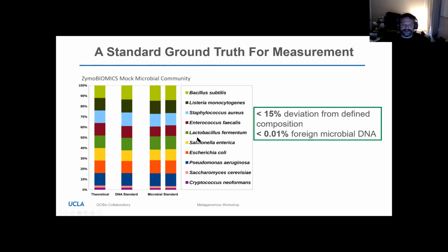So if you want to take the data that I gave you and see how it looks compared to this, it's actually fairly easy to do. You just have to do composition tables and that kind of thing. But what we're looking at here is a bunch of different microbes. If you notice the two at the bottom, these aren't bacteria, these are actually yeast.